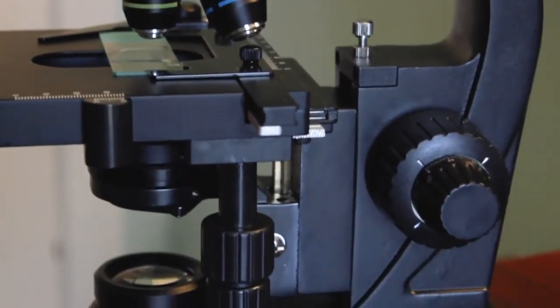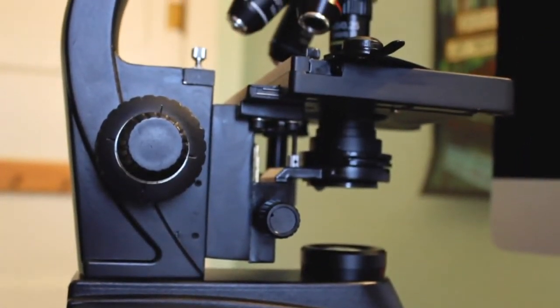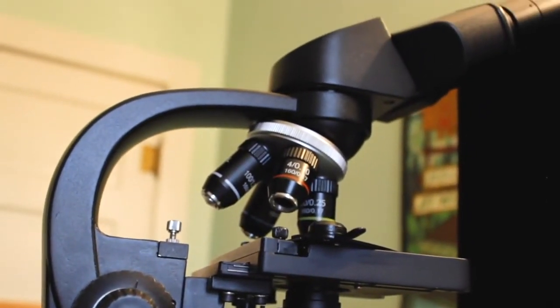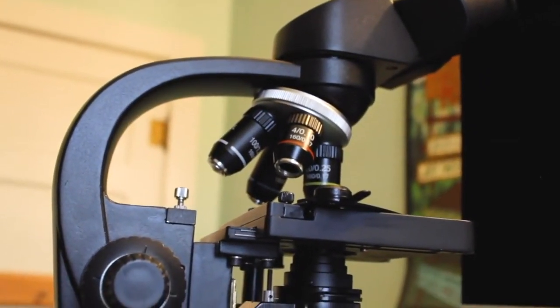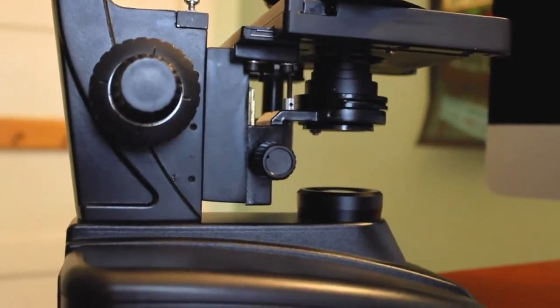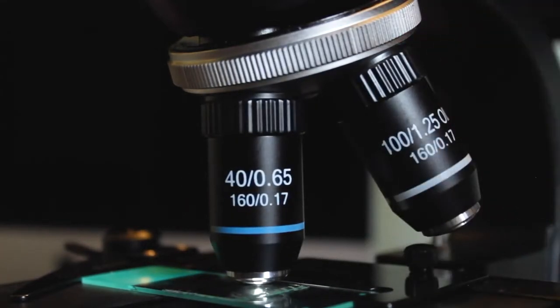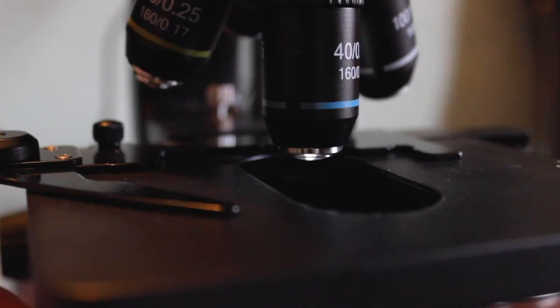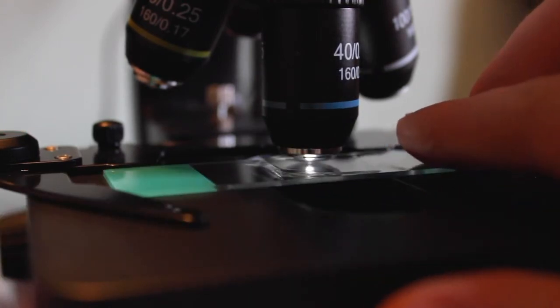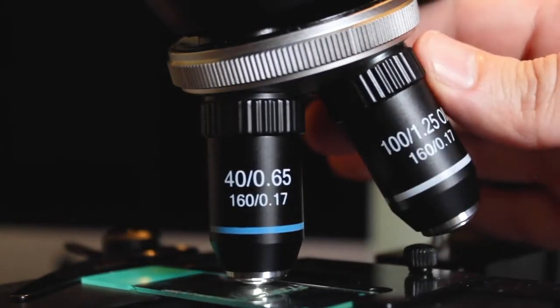One of the most common questions we get is, what microscope should you buy? But it turns out that's a complicated question. Filters, objectives, eyepieces, condensers, and we think you should know about all of that, but it's not as simple as just linking to a microscope that's the best option. After all, the body of a microscope is just a stand. It's the things you tack onto it that make it great. And so, we wanted to build something we think is a great base-level microscope and also provide some options to tack onto it depending on your goals.